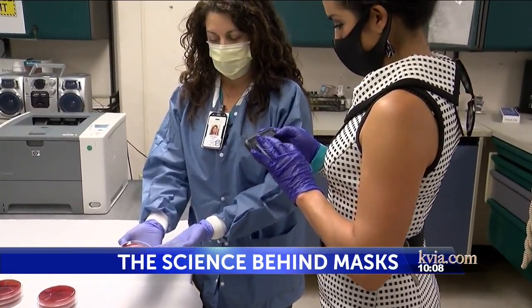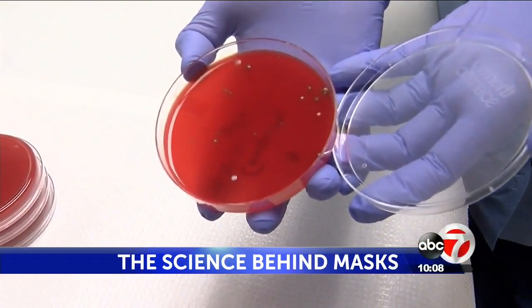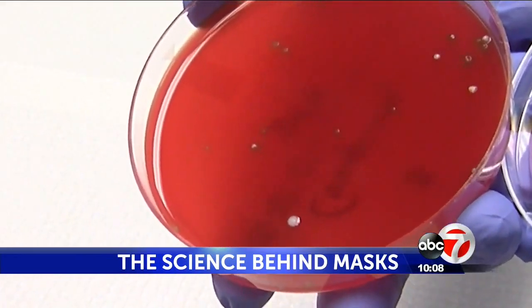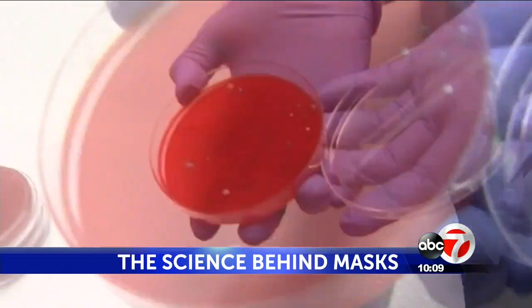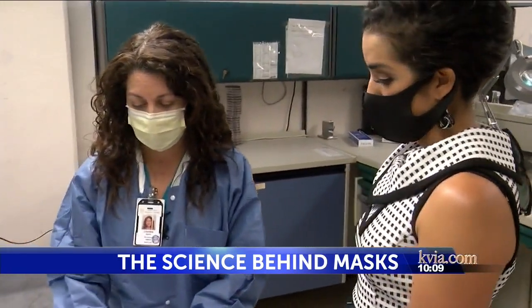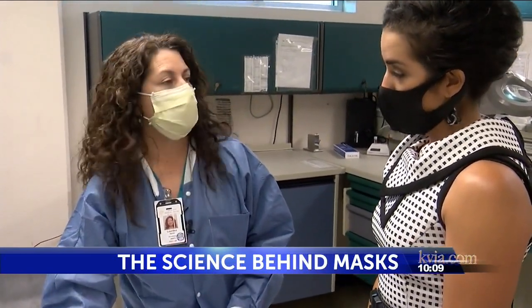Sure enough, there was bacterial growth from my coughs and sneezes delivered at 2 feet distance. And take into consideration that these were all fake. So when you actually sneeze, because you have something in there, it's going to be a lot stronger, and it's going to have more stuff coming out. Okay? So then we have the ones you were holding while wearing a mask.